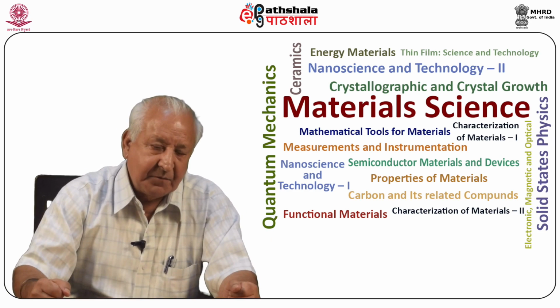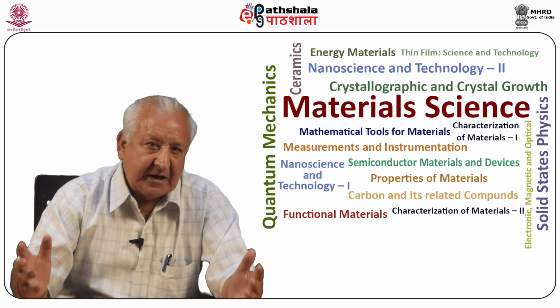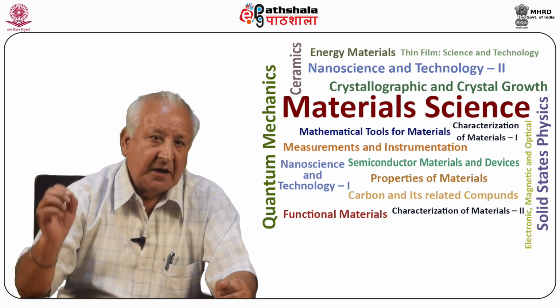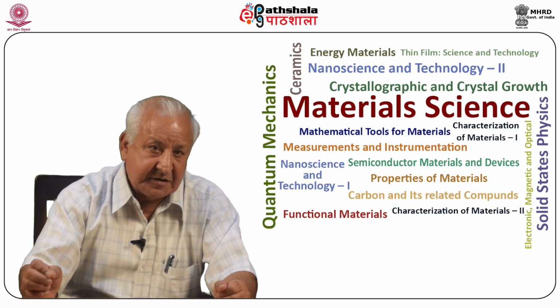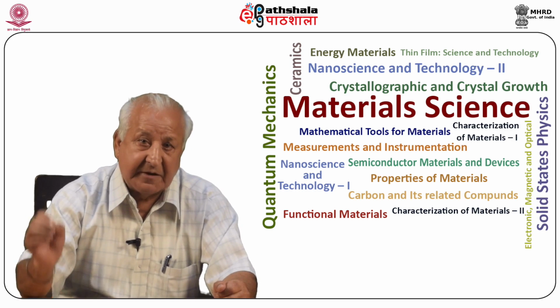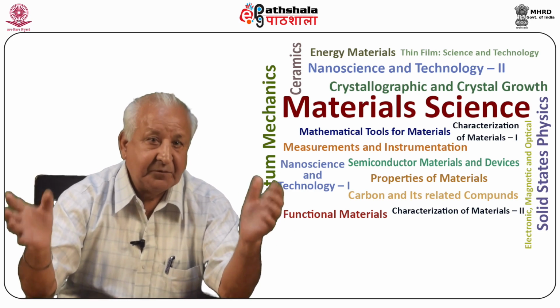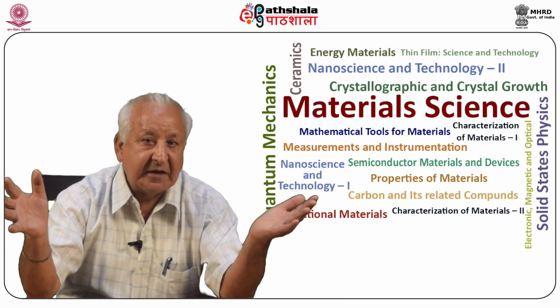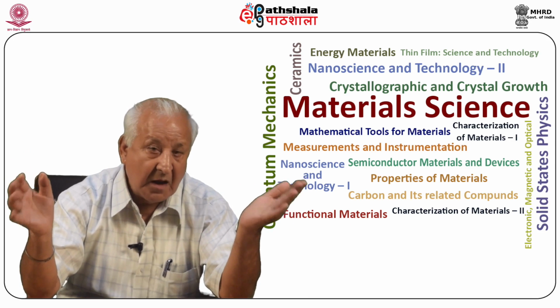Advantages of gel method. Some important advantages of the gel technique over other crystal growth methods are: number one, silica gel being optically transparent, crystals can be observed in all stages of growth. It helps in studies on growth kinetics and in making in situ observations.